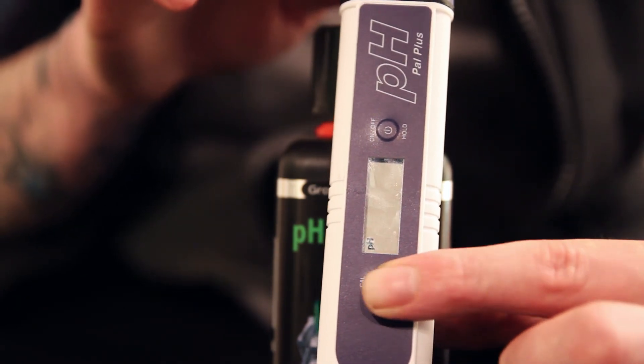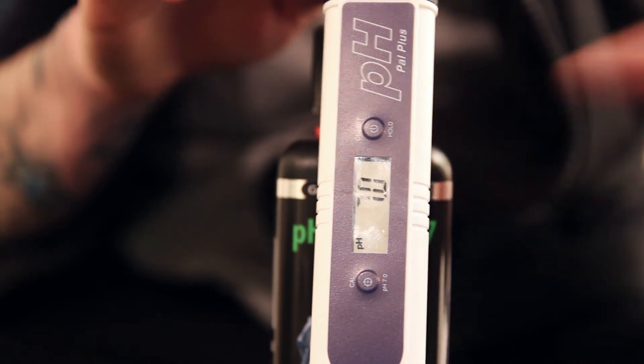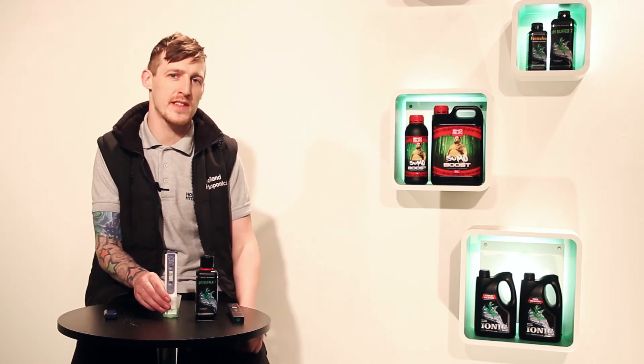Press and hold for about 2 seconds, then let go. At this point, you'll start seeing numbers flash on the front of the LCD. That should read 7.0. If it reads 7.0, leave it — it will flash for about 30 seconds. After that, your pH pen is calibrated.